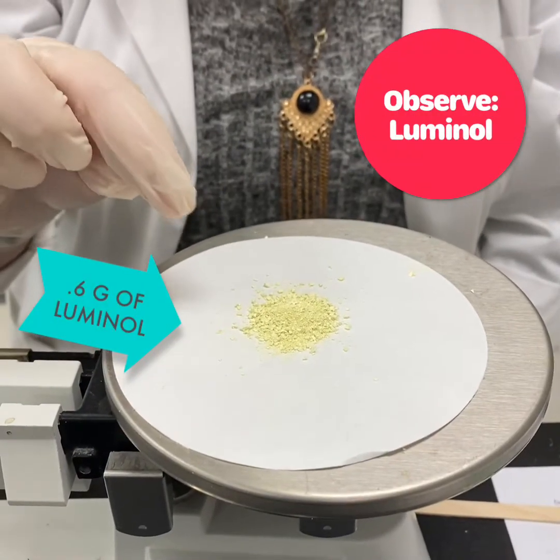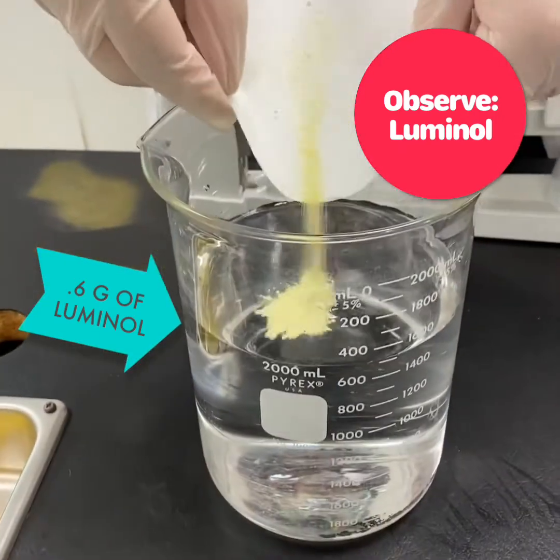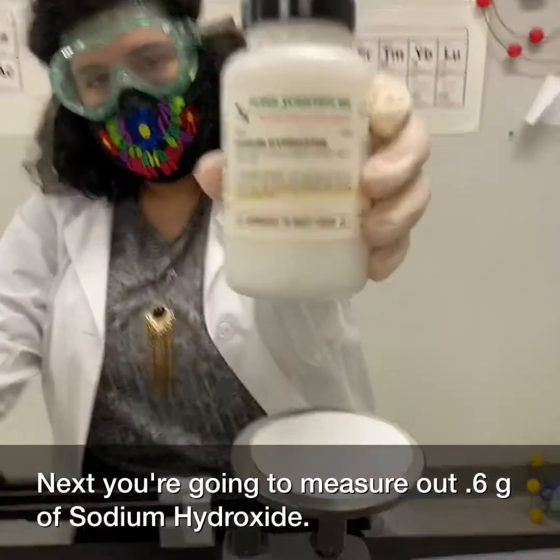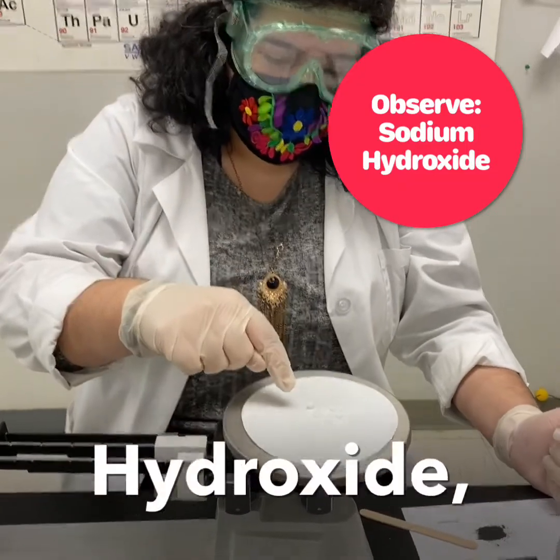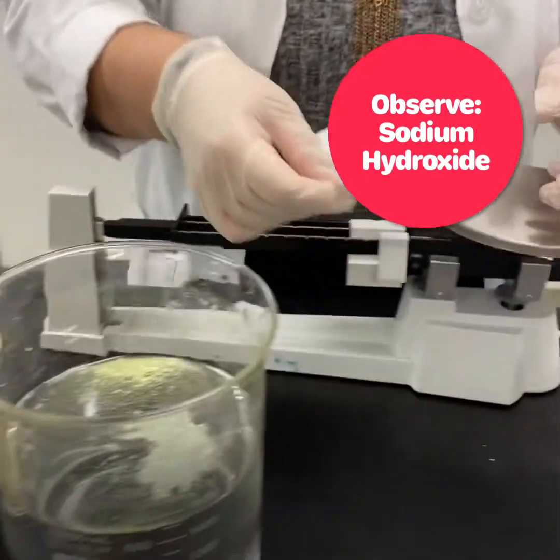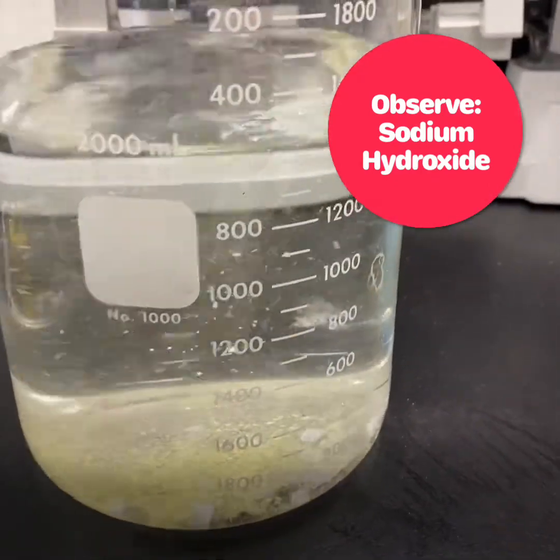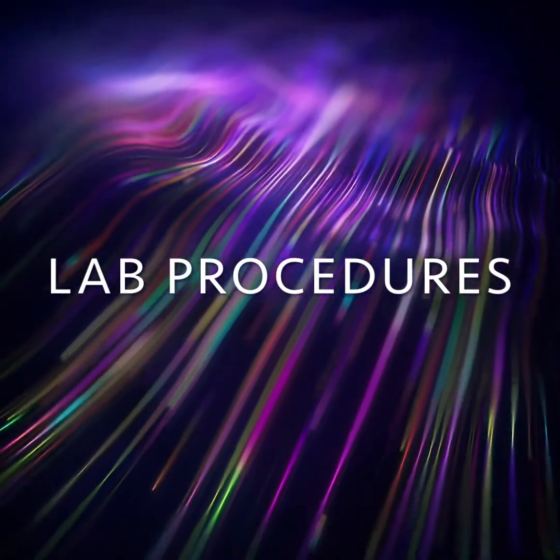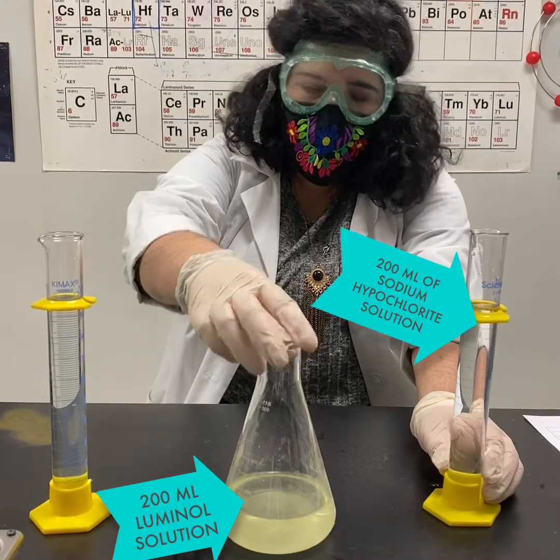This is 0.6 grams of luminol, which we're going to add into the water. Next, you're going to measure out 0.6 grams of sodium hydroxide. Observe your sodium hydroxide — they're white pellets. Now we're going to add them into the water and stir until about 90% dissolved.